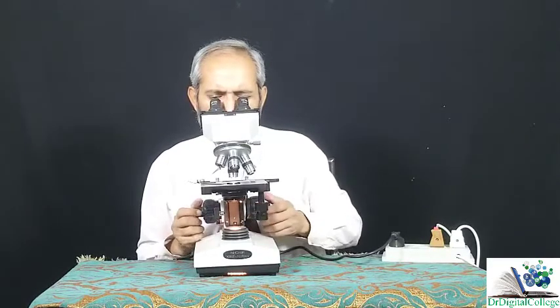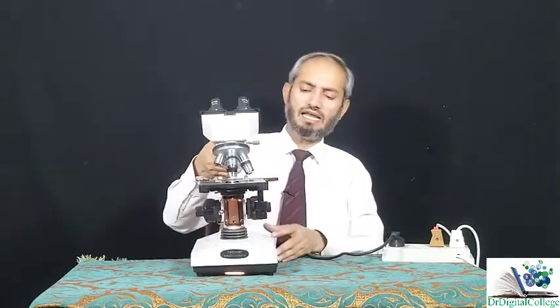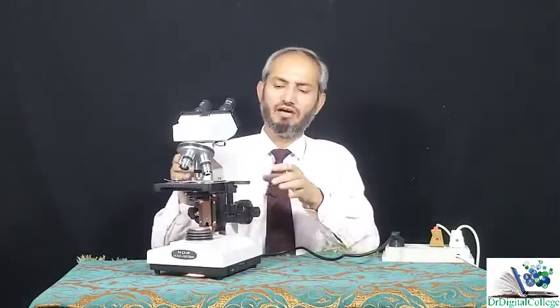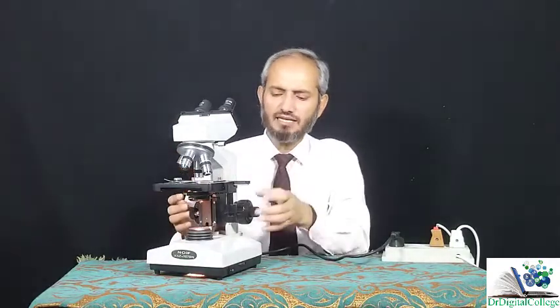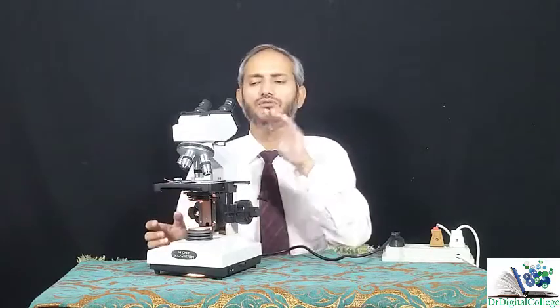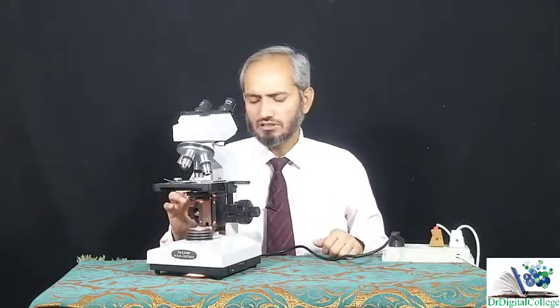Now I can see this is my object. So you will have to move this stage very slightly while some dust is observable. Adjust the position of your object and then slightly move it. Now you will be able to see. Now lock your stage.